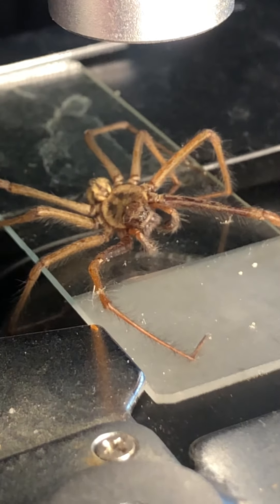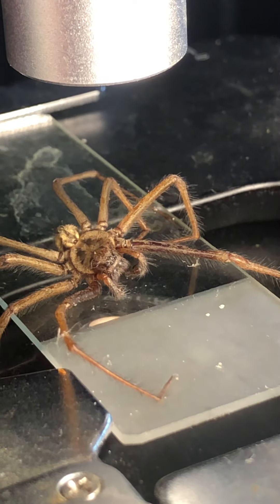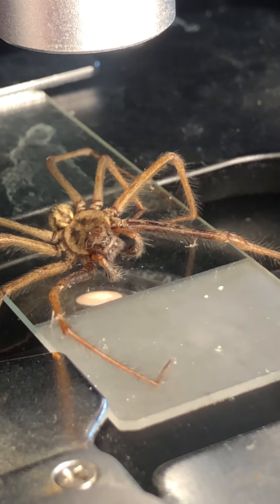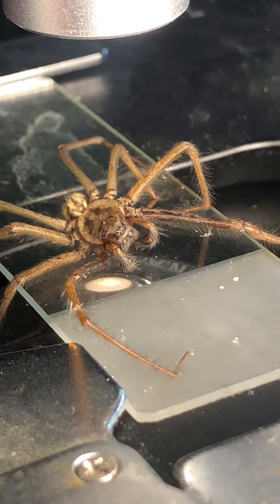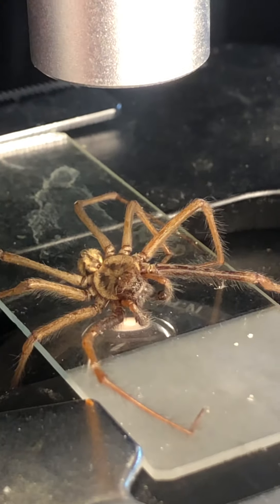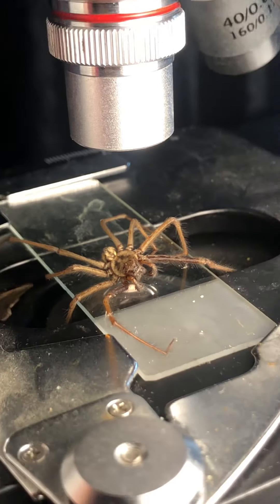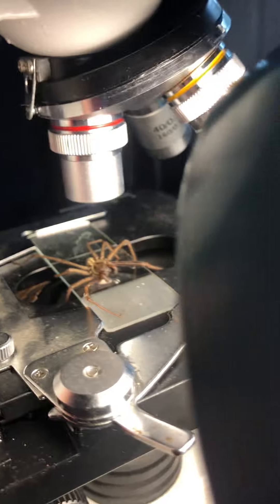What is that? It's not very good. That's a leg. That's a leg. I'll get it down.